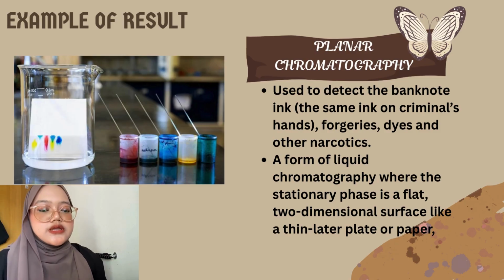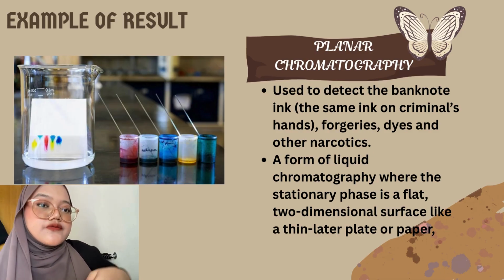Where do we particularly use this? It is useful for checking ink, like finding fake money by looking at the ink. It can also be used to find dyes or certain types of drugs.